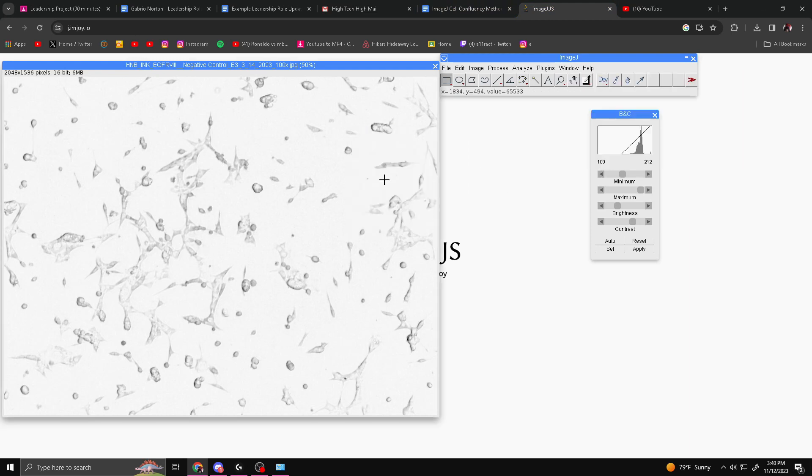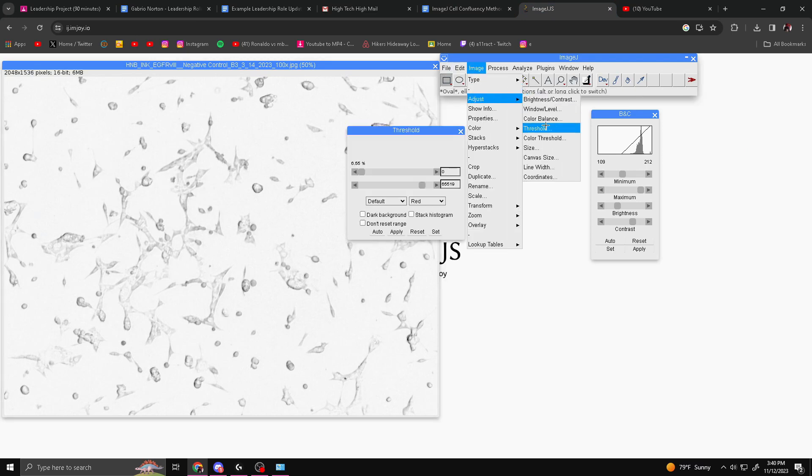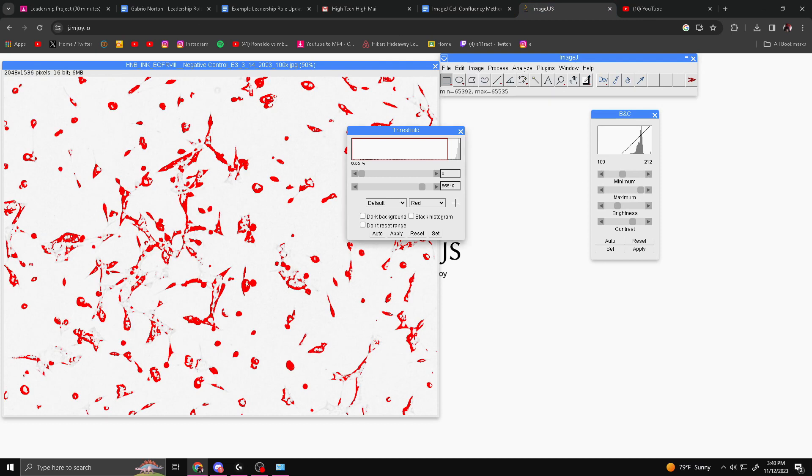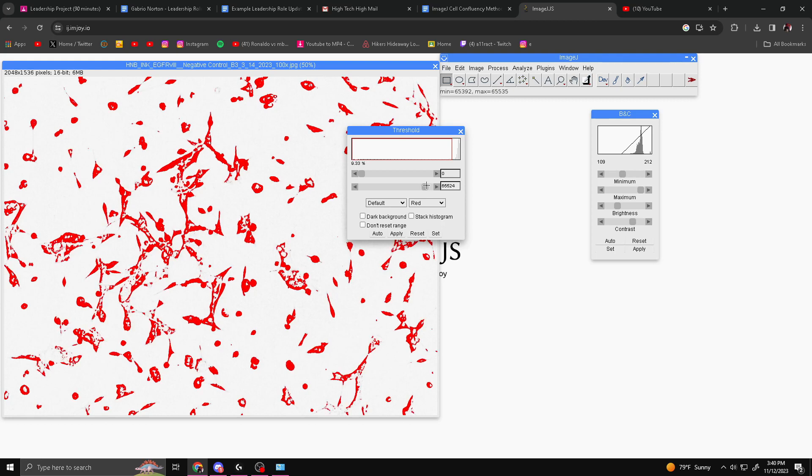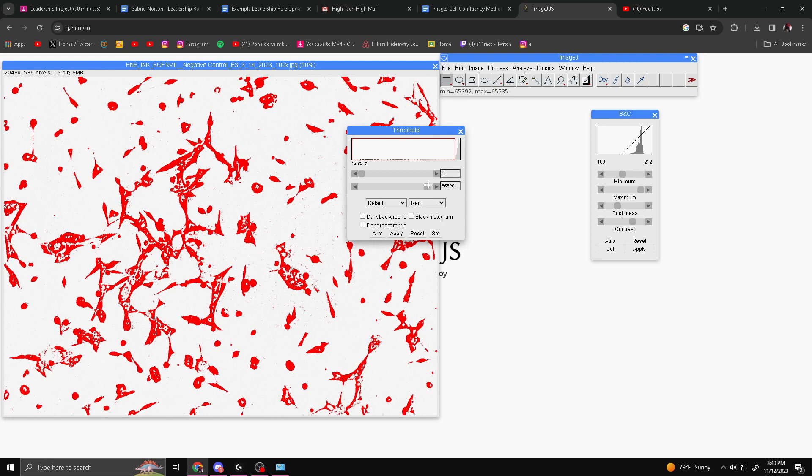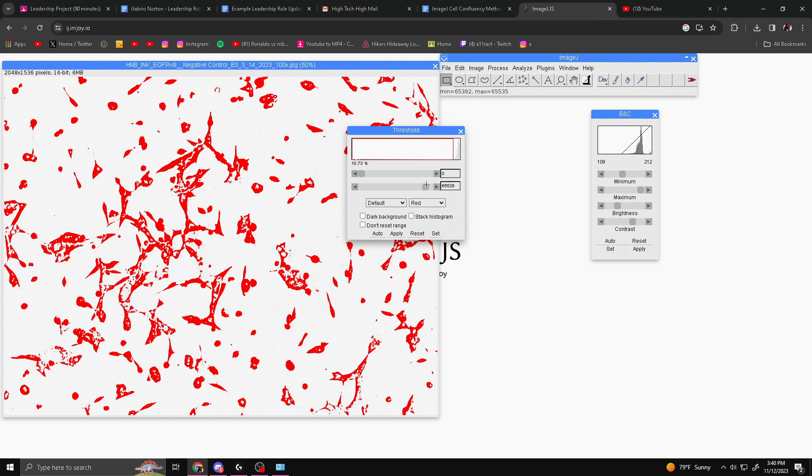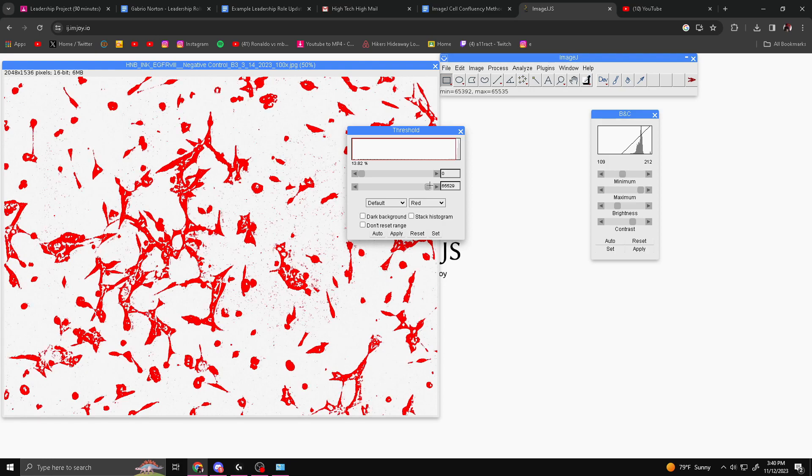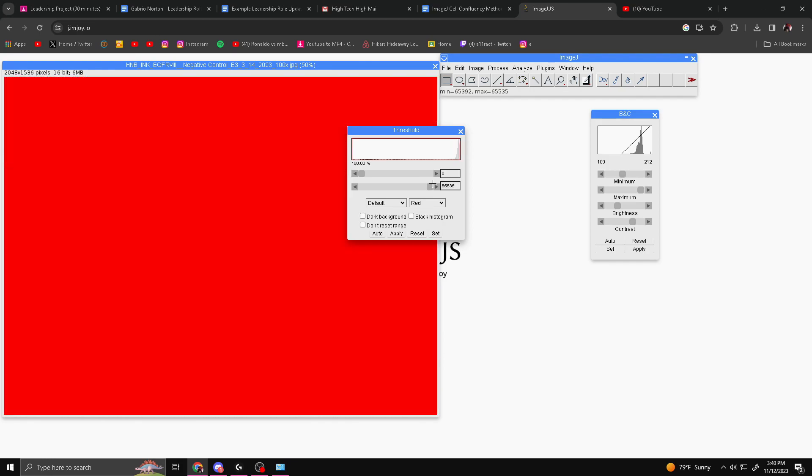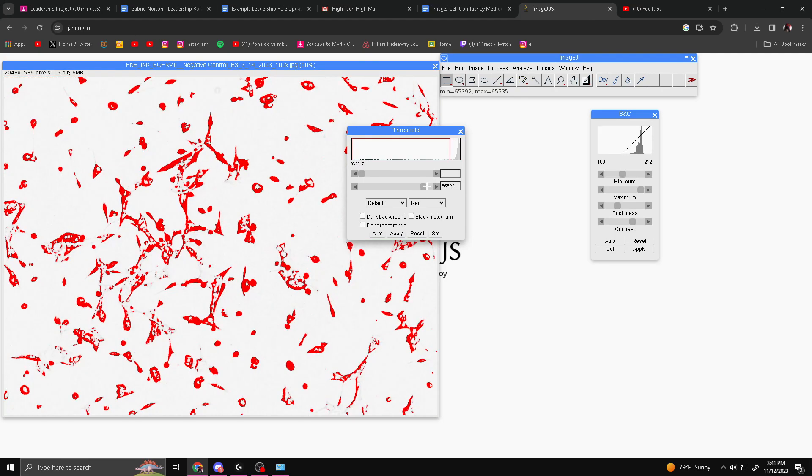Next, we're going to select the Image Threshold. You can do this by going to Adjust and then Threshold. Make sure this top bar is all the way back at zero. You basically just move the bottom one until the red covers the cells fully. It'll look somewhere around this will be fine. Now if you keep going, you'll see that the whole thing will eventually turn red, but you don't want that. You just want the cells to be covered pretty much.